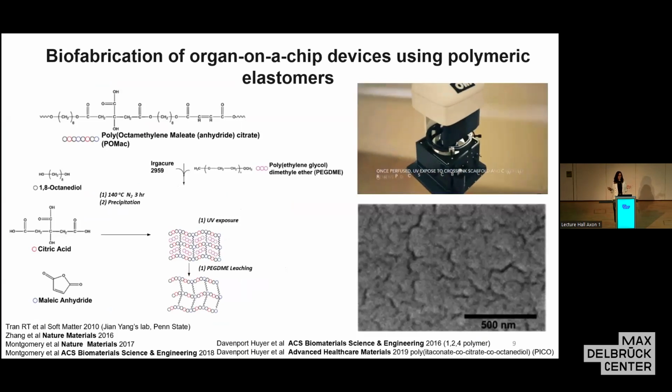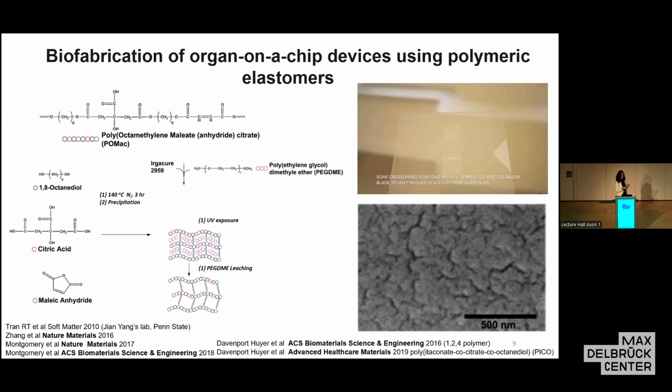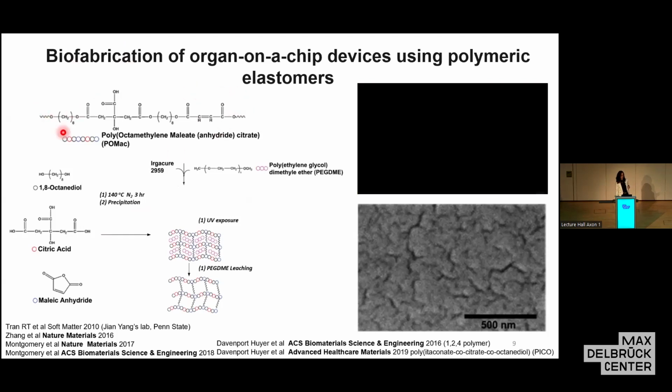It's very easy to make because if you talk to a chemist, I'm a chemical engineer by training. If you talk to a chemist, they say we are not true chemists, which is probably true. So we can only do simple chemistry, but we are not true biologists either. So we are kind of in between, right? And it's very easy to make this polymer. You can just take monomers, put them in one pot. If you elevate the temperature, you melt everything, you're going to get this linear prepolymer.